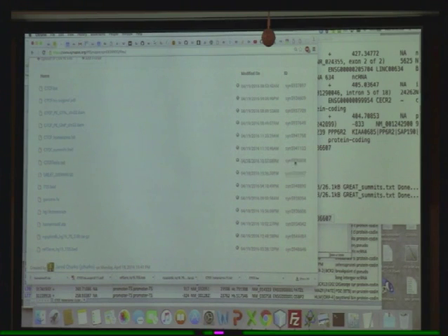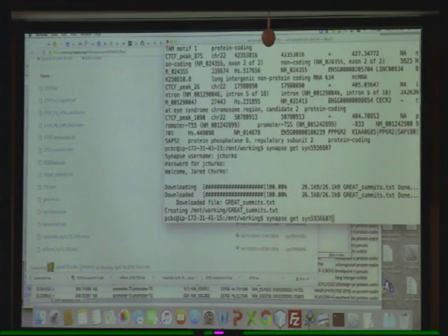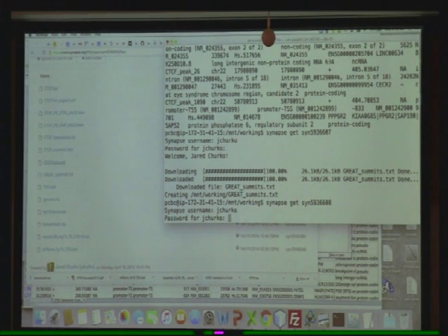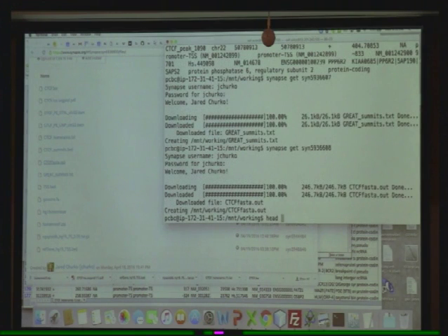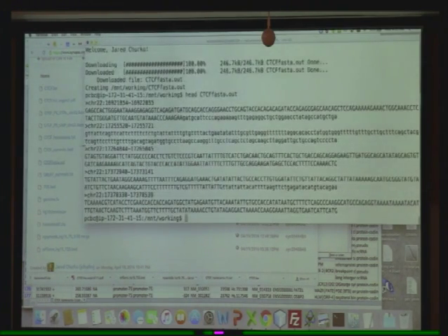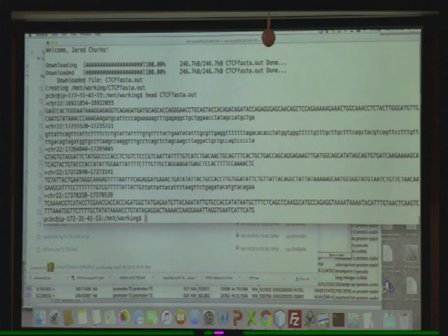FASTA.out, it's this one. So again, this step is important for taking your coordinates and getting the sequence of that region. Here I gave it a bed file that contains chromosome 22 and approximately 100 base pairs within that region, and it pulled down the sequence in that region.